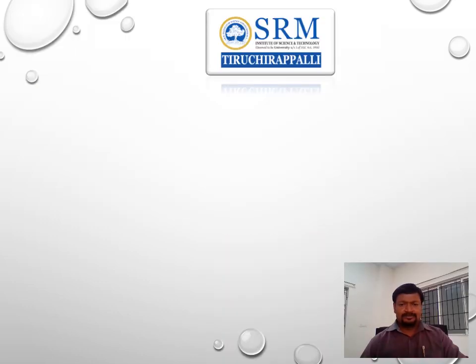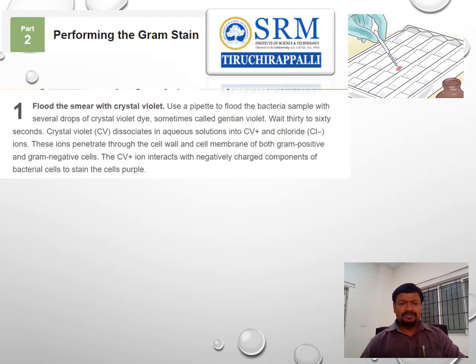Second part of the gram staining: perform the gram stain. Flood the smear with crystal violet, the first stain. Use a pipette to flood the bacteria sample with several drops of crystal violet dye, sometimes called gentian violet. Then wait 30 to 60 seconds.